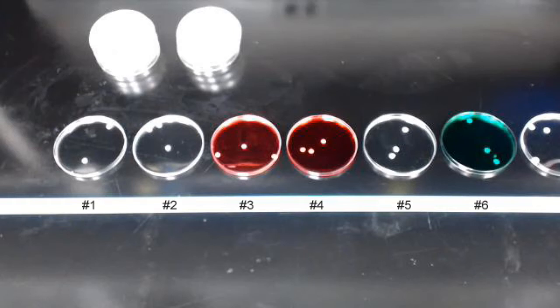Now you're going to see in just a moment, as I move the position of the video camera, that we are going to be evaluating 12 different chemical antimicrobials. I have dispensed a small amount of each of the 12 chemical antimicrobials into each of these 12 dishes. The names of the chemical antimicrobials are listed in your module, Module 15.